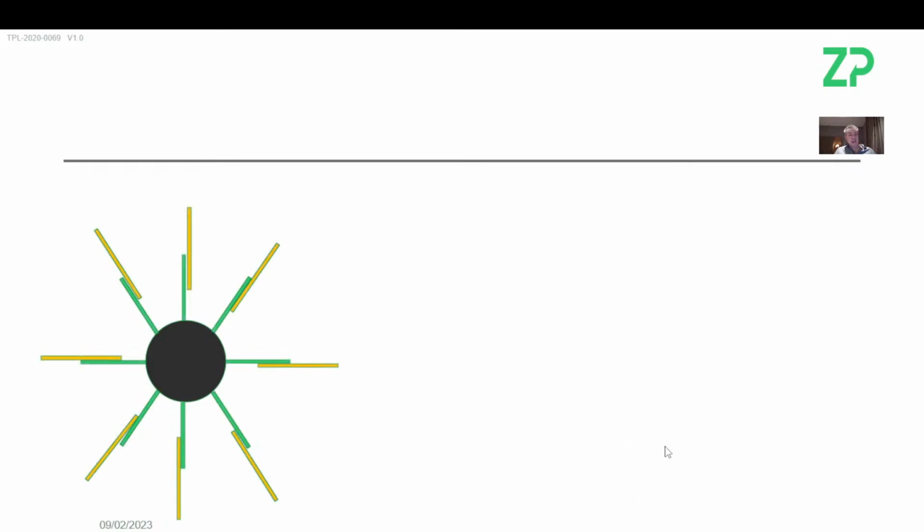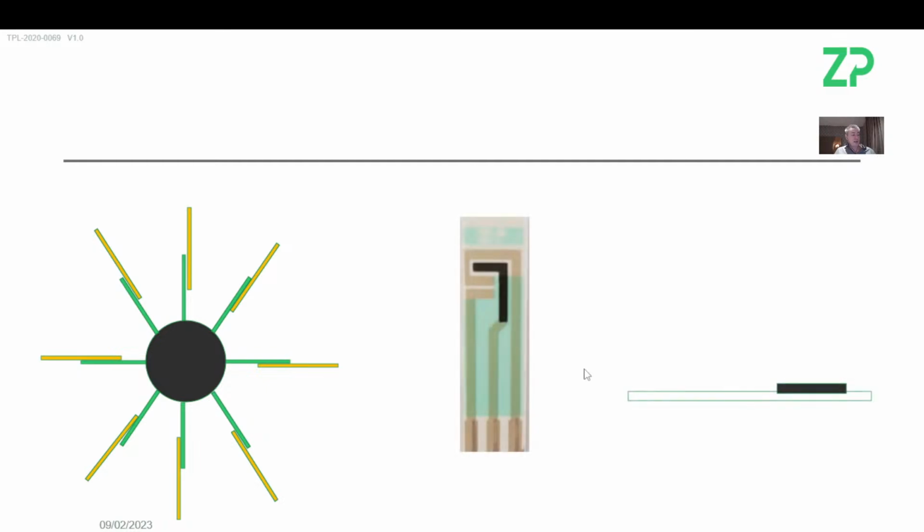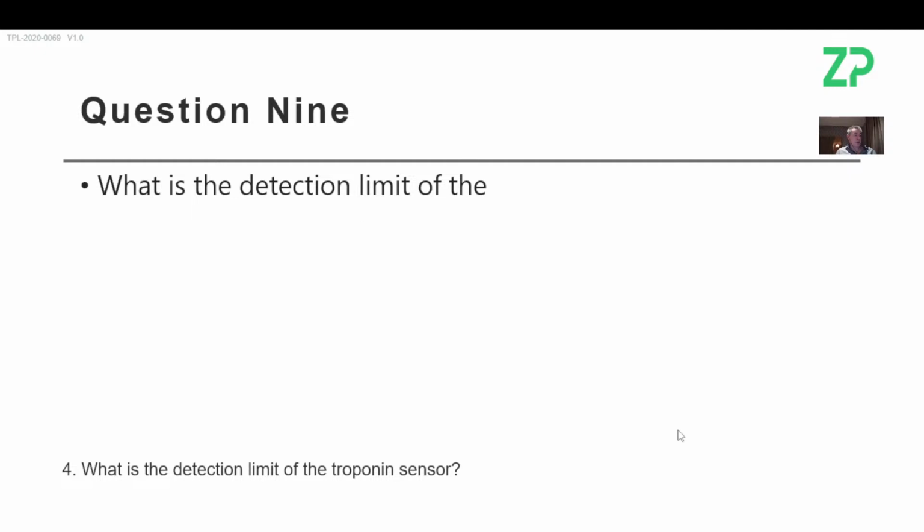I think there's a slightly simpler assay where you just capture your probe, your DNA target, let's say, and bring that to the surface. And in your buffer, you have, for example, something like ferricyanide. This is a slightly simpler assay, and I think this might also work, so you might as well give that a try as well.